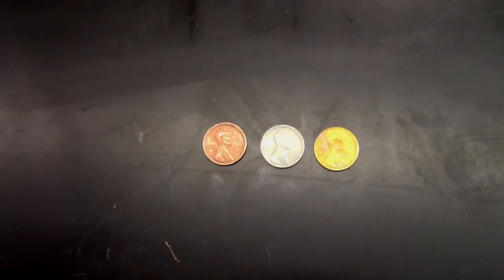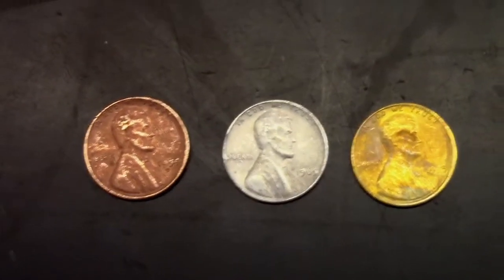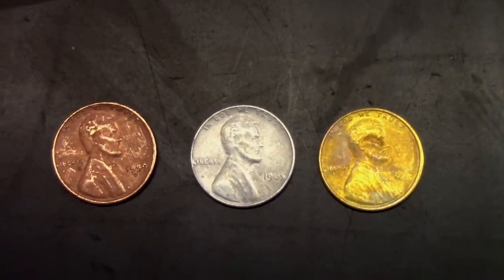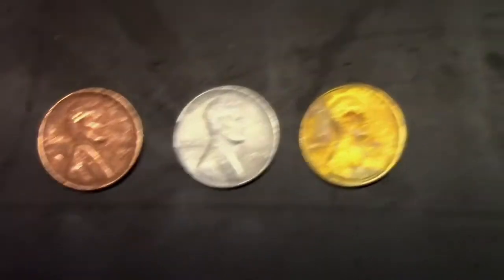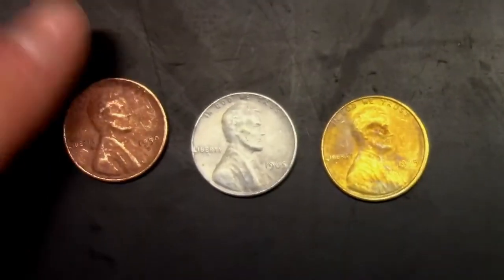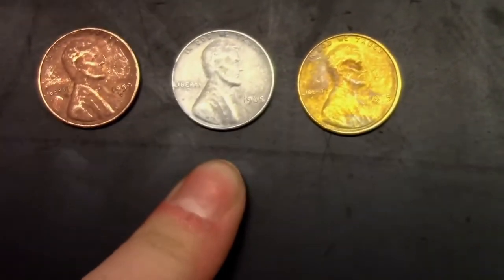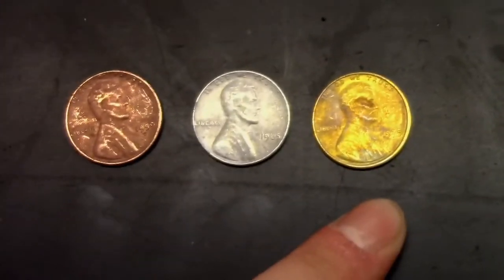All right, I apologize for my shaky hand here. I'm just holding my camcorder. But I had us do 3 separate pennies, 3 separate trials for a reason. And y'all, that's this end product. Look at this. Isn't this so cool? Copper, natural copper here. Oops, sorry. Natural copper coated in zinc to look like silver. And then we have this beautiful brass alloy.